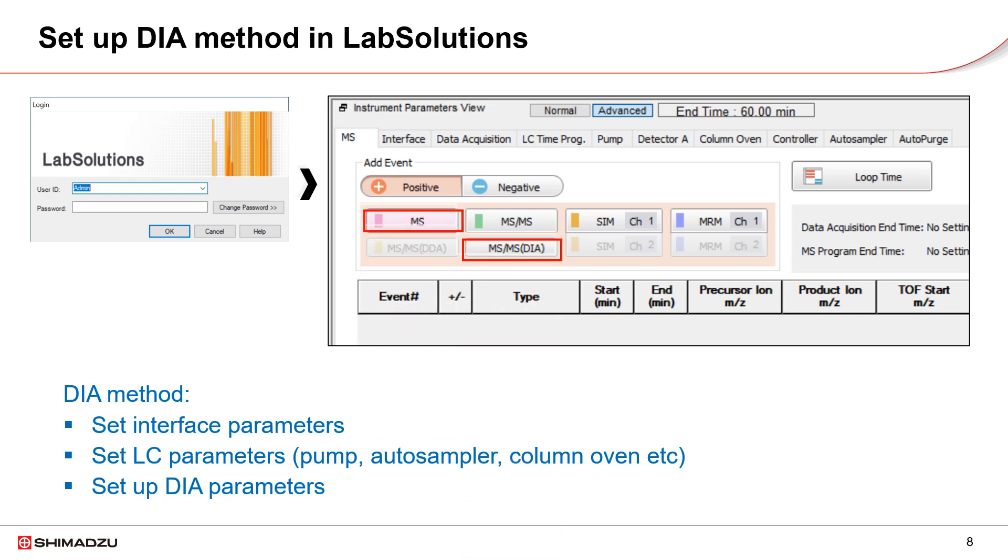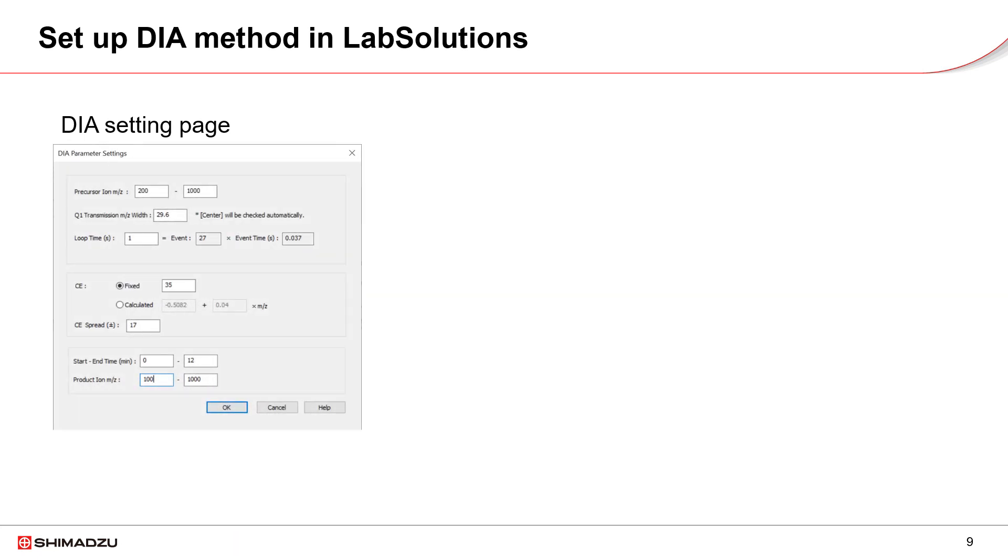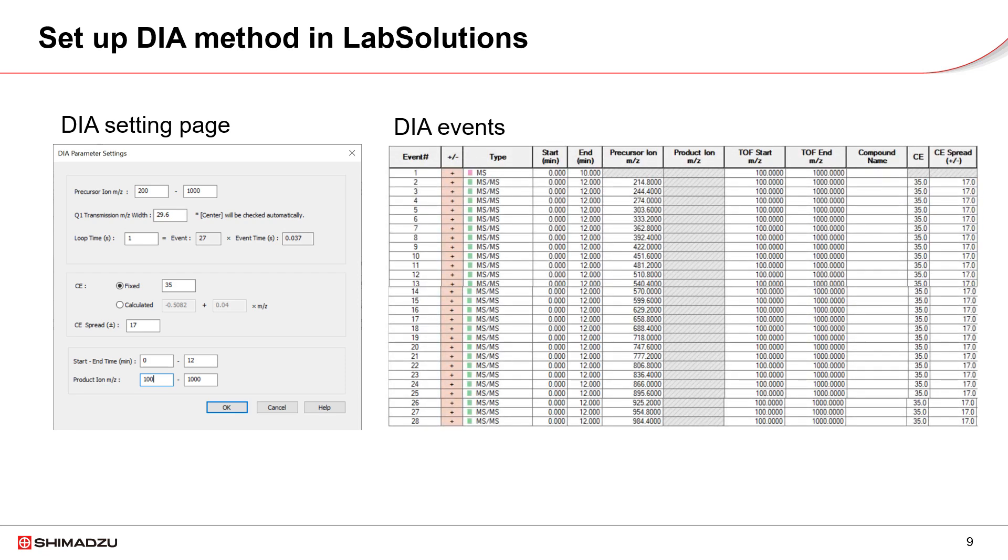We can include MS event, then add MS-MS-DIA event. Fill in all the parameters properly, balance event number, event time and loop time. Usually, the loop time of DIA method should be one second or below in order to acquire enough data points for even a narrow peak. Click on OK button, we get the event details of the DIA method.